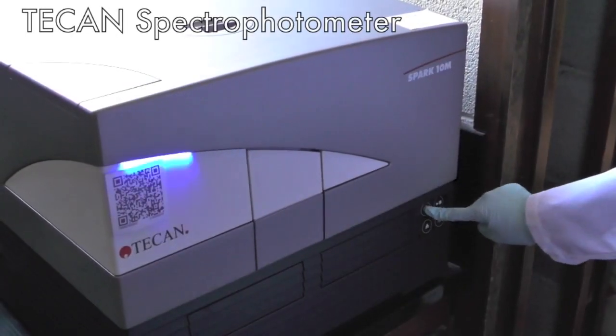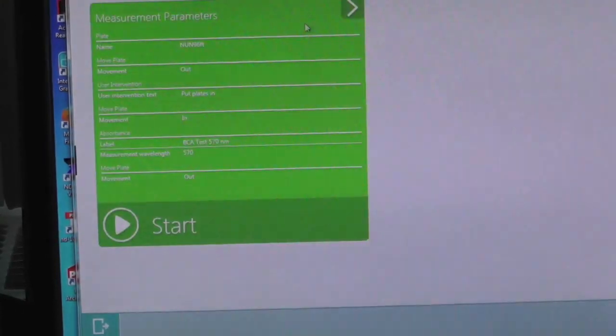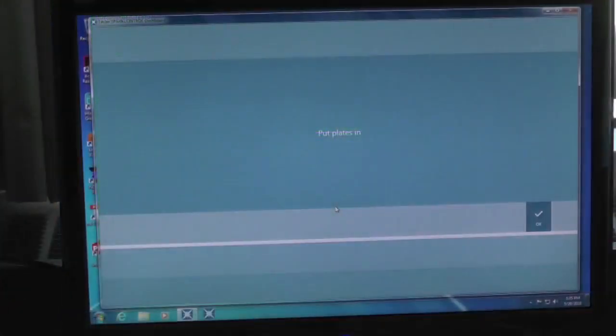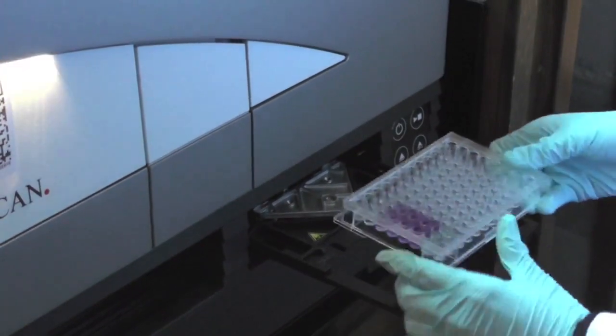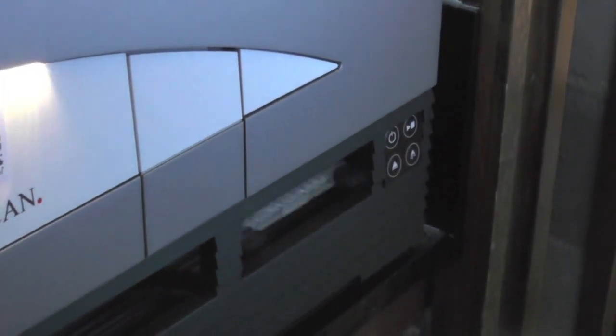Set up the Tecan spectrophotometer to read the absorbance of your sample at 570 nm. Remove the foil cover. Make sure the well A1 is at the left top corner when you place the microplate into the plate reader.